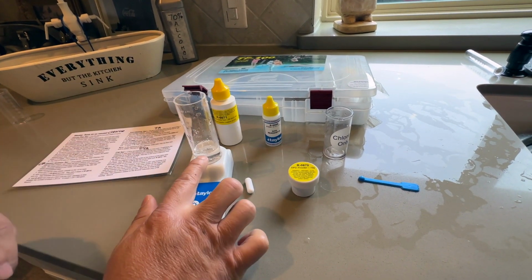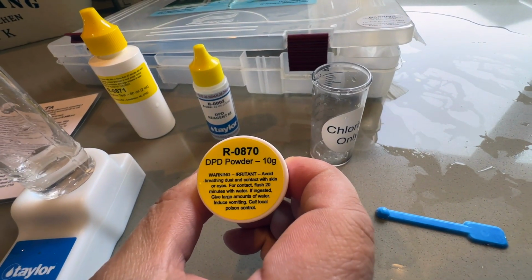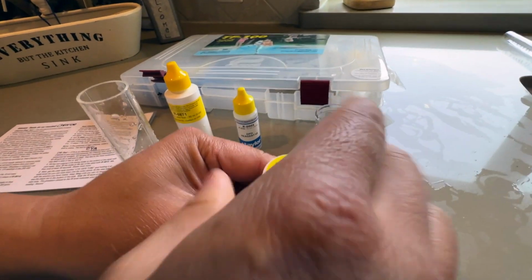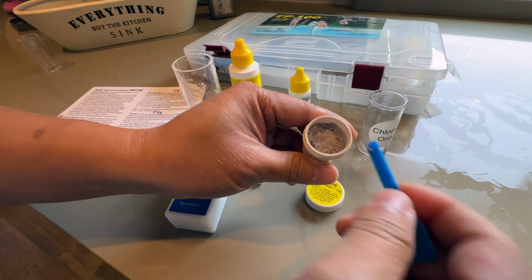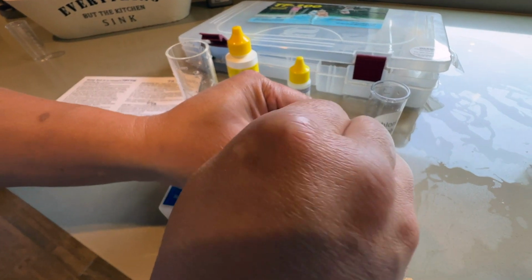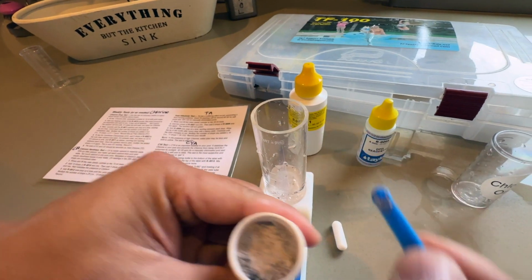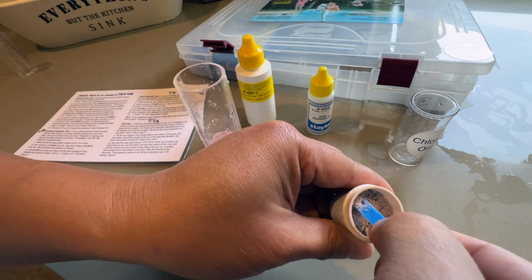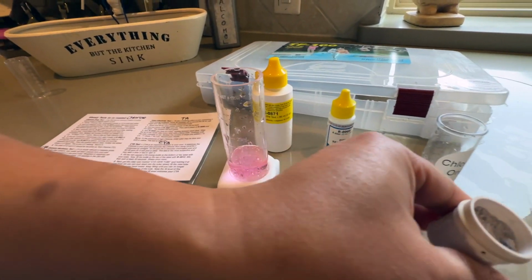So after you add the 10 milliliters, you're going to get this powder. This is called the DPD powder, R0870. You're going to scoop out very little of this powder. This is called a heaping scoop, and I'm just going to scrape and scoop. That's not quite one, so I'm going to add another one. I'm supposed to add 1 scoop. That's probably a little bit too much. Okay, it doesn't have to be super precise.